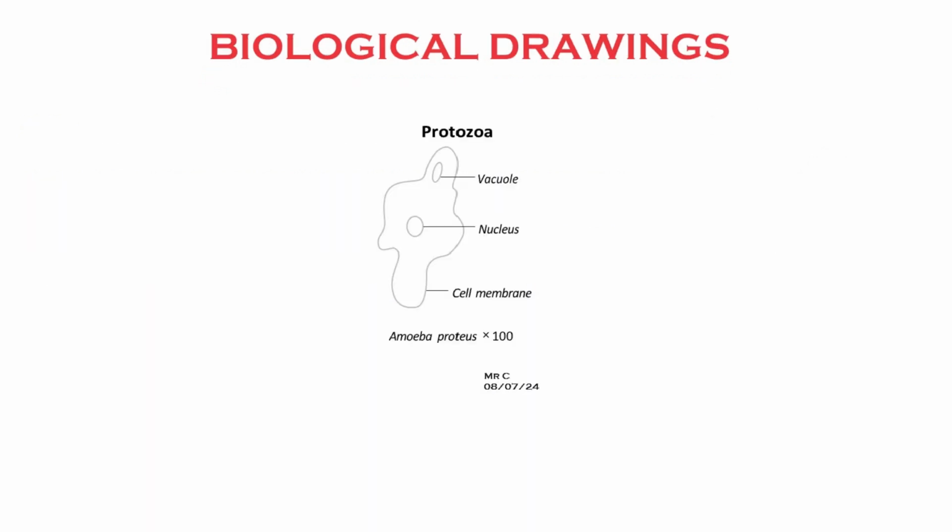The last thing we're going to talk about is biological drawings from what you see down your microscope. Be sure to use a soft lead pencil for all your drawings, your labels, your name and other information, and be careful not to smudge your drawing. Use only unlined paper. Put a title on your drawing in the middle at the top. Your drawing should be approximately 1/3 of your page, and keep your drawing to the left-hand side of the centre to allow for your labels, which will appear on the right-hand side.